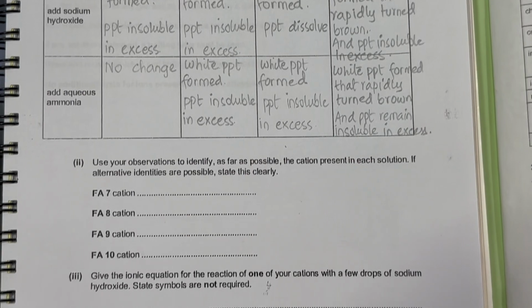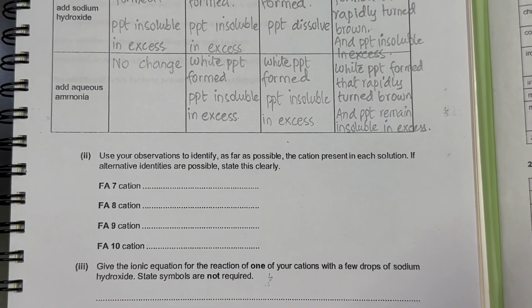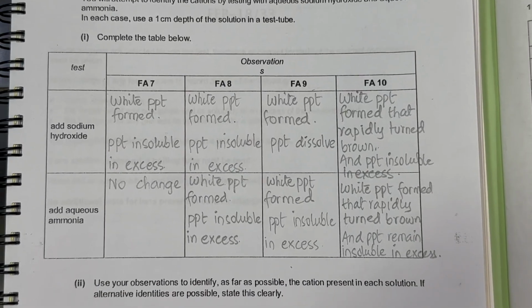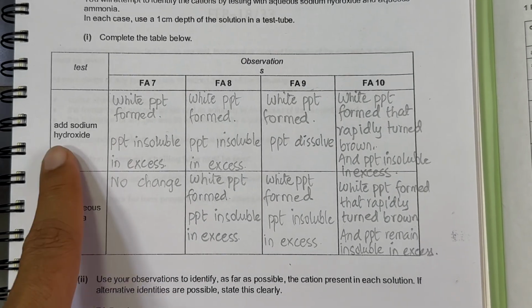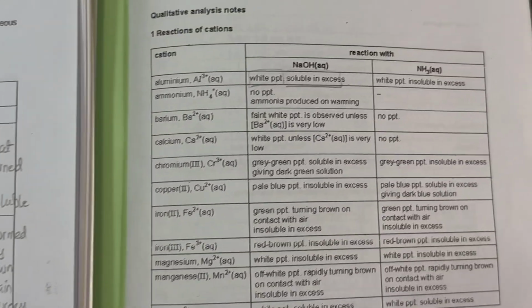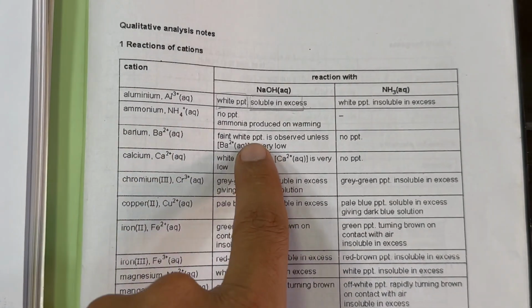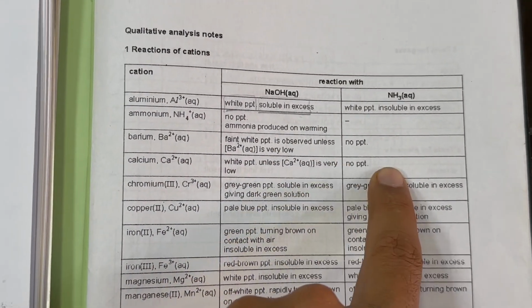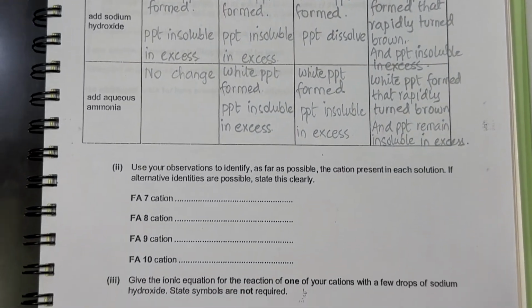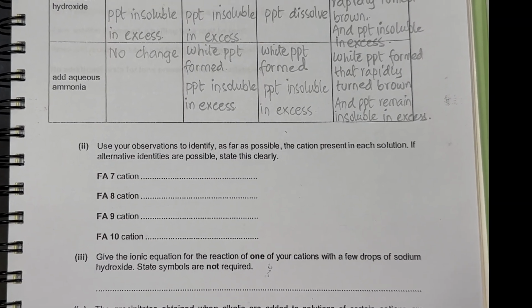Let's move on to the next part, which says, from your observations, identify as far as possible the cations present. Now, if we look at Fa7, it has given white precipitates with sodium hydroxide and no change, no precipitate with aqueous ammonia. And if we look here in the table, barium 2 plus and calcium 2 plus show these responses. It means this Fa7 is either barium 2 plus or calcium 2 plus. So let's write this here.